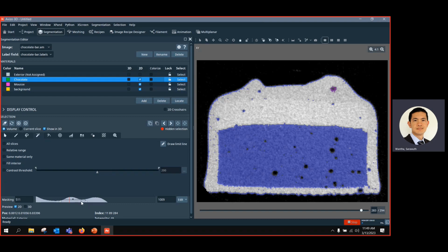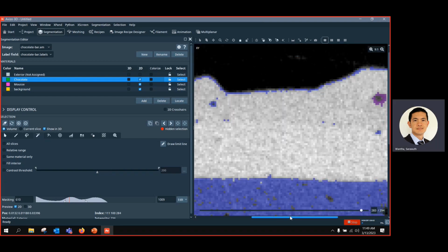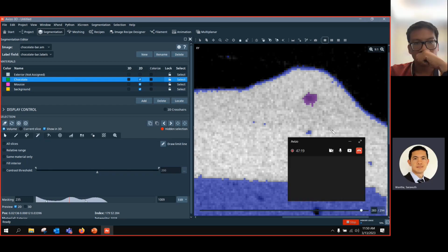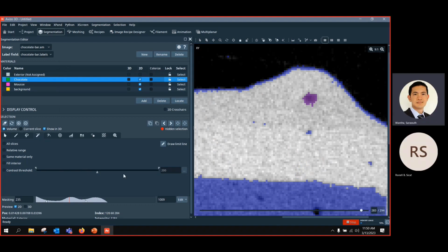Any voxel that is connected and within the range between lower and upper threshold will be selected. So if I adjust the lower threshold again, you can see that the number of selected voxels changes. Before, from 0, everything that is connected was selected. For example, here I select region growing at this value, so it's marked in red. If I set the lower threshold like this, everything still connected within the threshold will be selected.